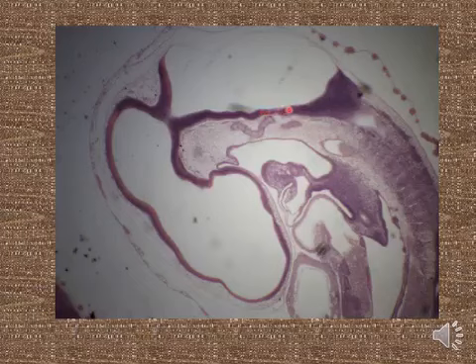And this arch is called the neuromeres of the myelencephalon. The cavity from the metencephalon and the myelencephalon is called the fourth ventricle. Also in these sections you can see part of the notochord and the dorsal aorta. Dorsally you can see the neural tube; ventral to it, the notochord; ventral to the notochord, the dorsal aorta, and the gut tube.